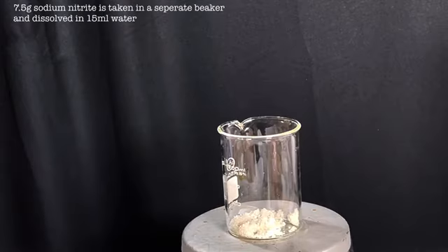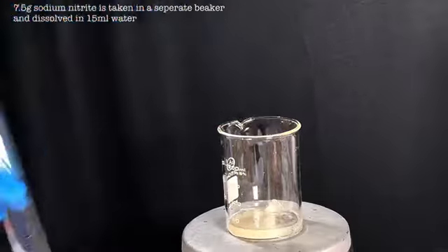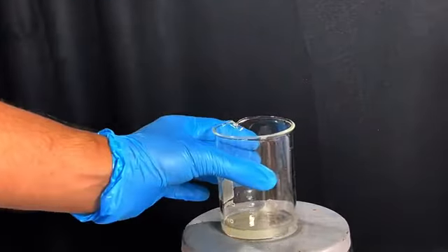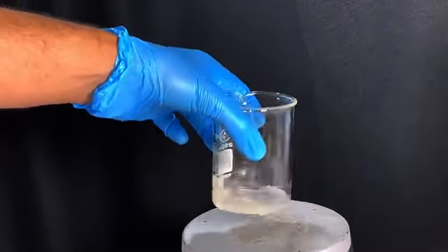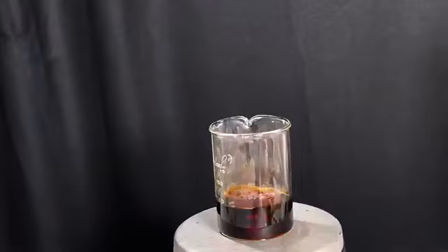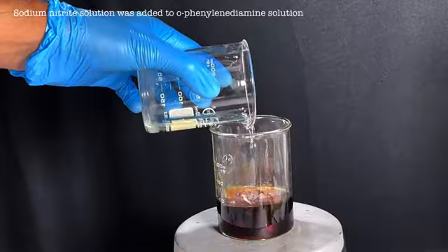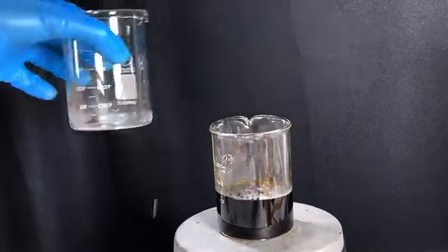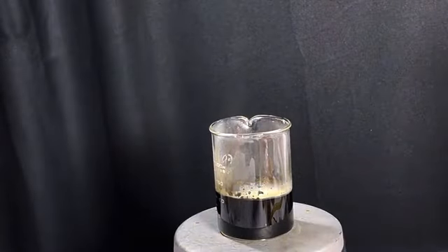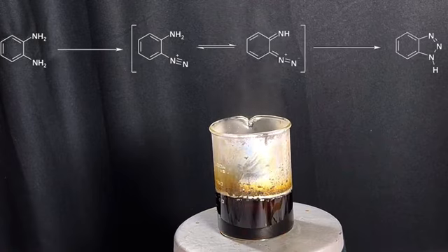In a separate 250 milliliter beaker, 7.5 grams of sodium nitrite was taken and dissolved in 15 milliliters of water. Then with stirring turned on in the previous beaker, the sodium nitrite solution was added to it in one portion. Immediately an exothermic reaction takes place and the temperature spikes to around 80 degrees C. You can also notice that the color of the solution in the beaker turns to a brighter shade.